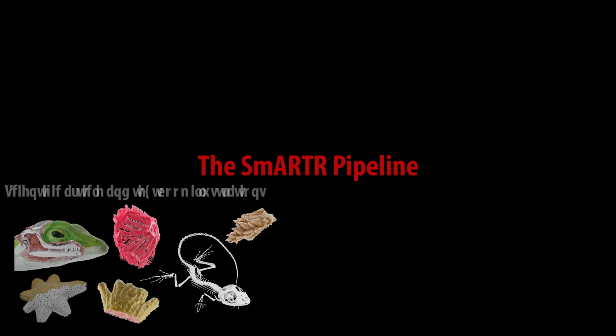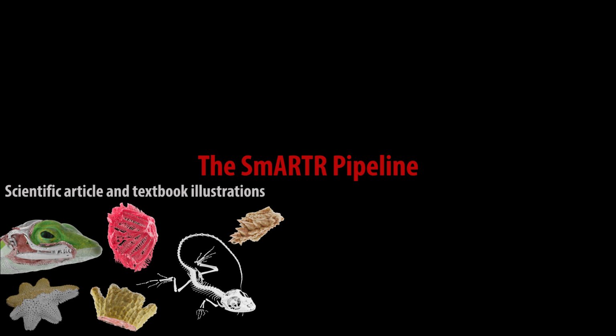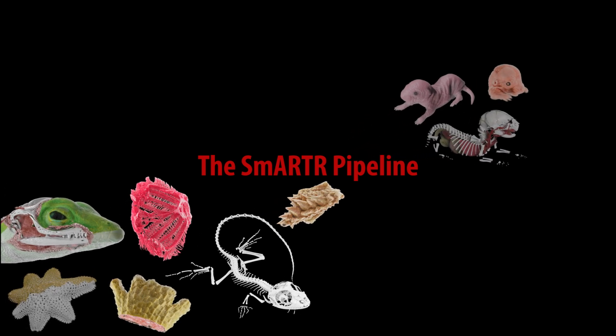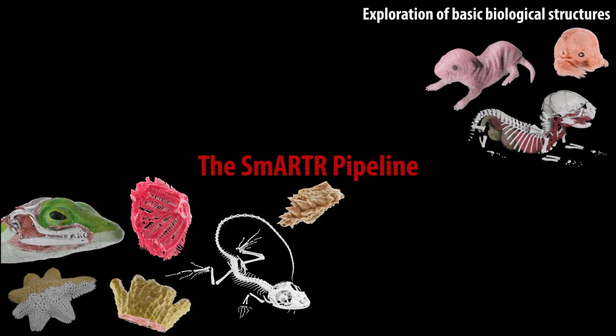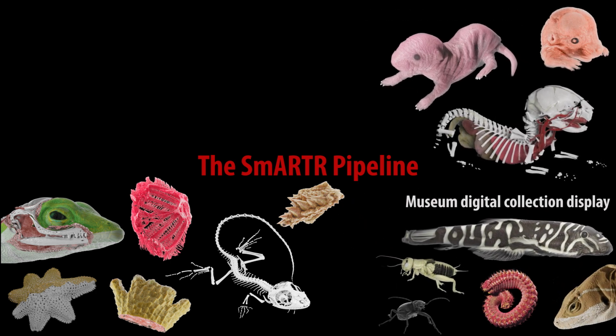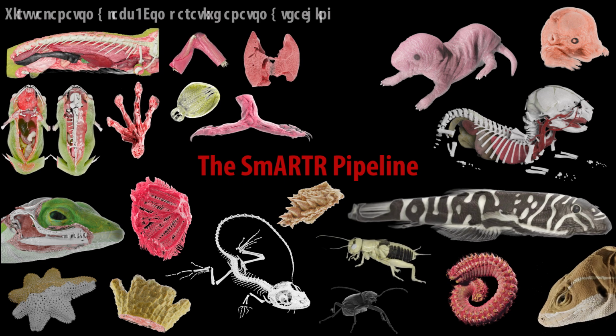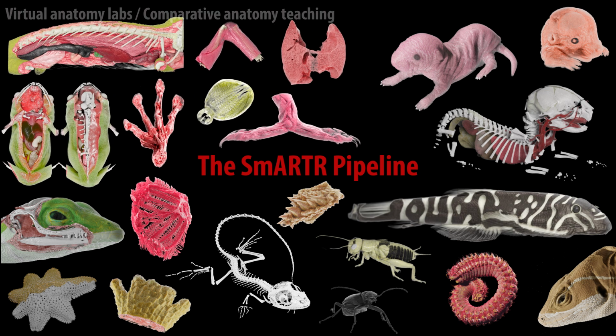As 3D imaging techniques become more accessible and widely used in biology, the SmARTR pipeline's potential applications are far-reaching. This versatile tool can be applied across a wide array of life sciences, such as evolutionary and developmental biology, comparative anatomy, paleontology, zoology, diagnostics, and veterinary medicine. Moreover, it also holds potential in education, outreach, and even artistic endeavors.